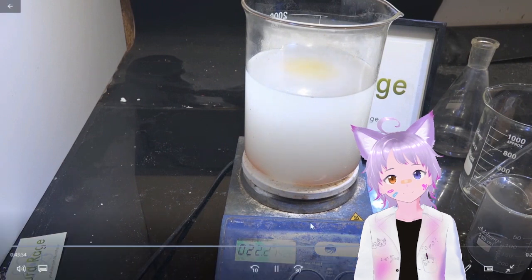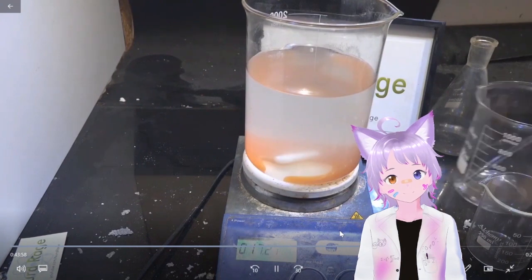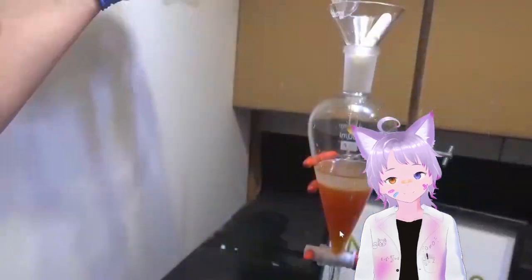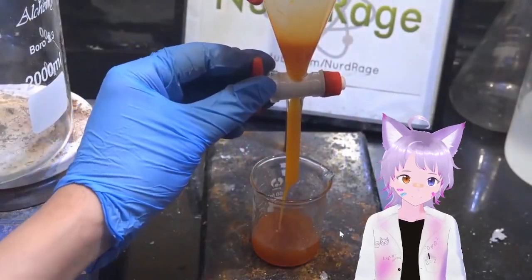Most of this is done in a few hours, but I'm going to let it go overnight. And here we are the next day. Organic layer on the bottom should have our product. Now pour off most of the water and use a separatory funnel to get the rest. I recommend washing the organic layer again with 100 milliliters or so of water for further purification.